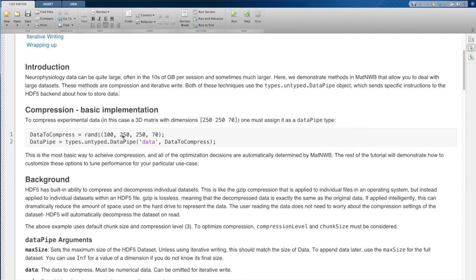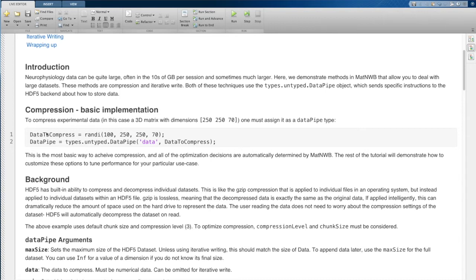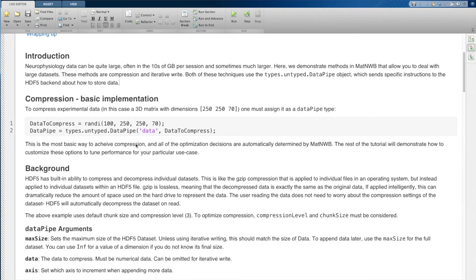We're going to make a 250 by 250 by 70 data set. So in order to use the data pipe object, all you need to do is instead of inputting this data into your constructor for a class, you just wrap this data in a types dot untypes dot data pipe object.